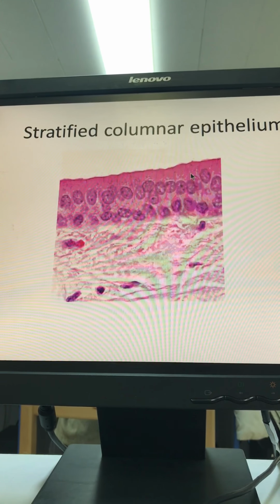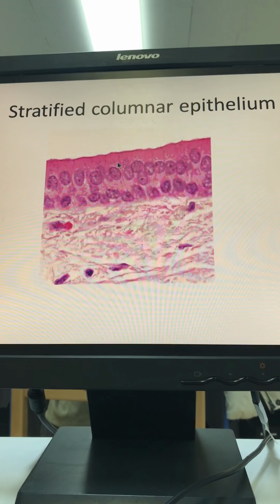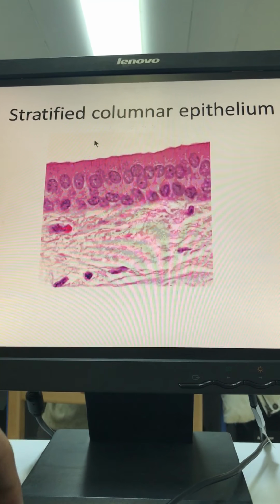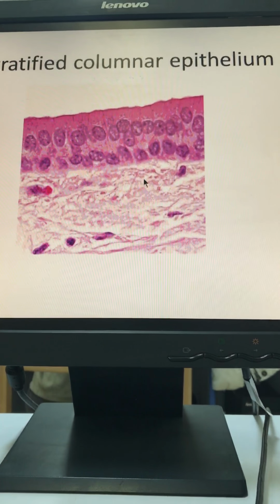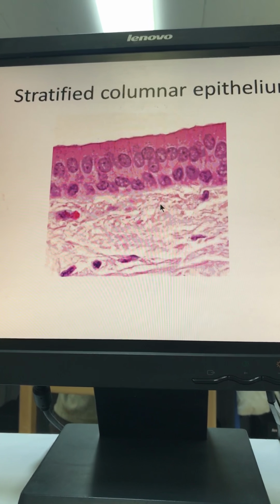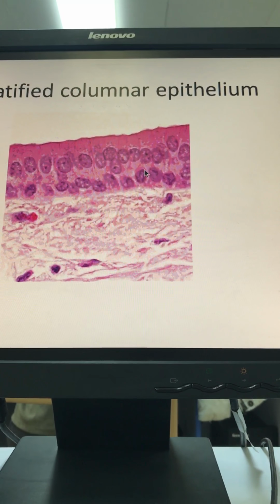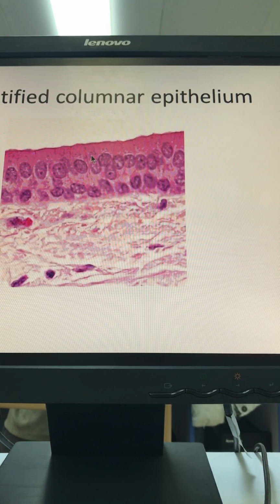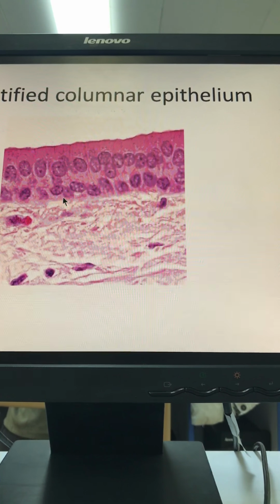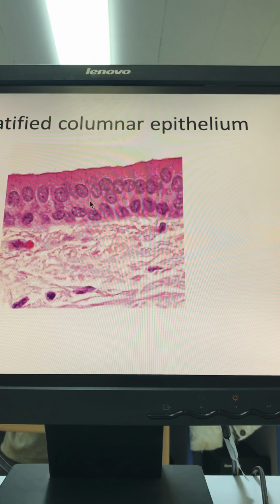Now, look here please. I can see two layers of epithelium. مش هيك? This is the surface. This is the free surface, apical surface of my tissue. Here the basal surface. Next to the epithelium شو التيشو هذا بيكون؟ Connective tissue. We have two layers here, okay? Two layers. Now I can notice that the top surface layer حكينا احنا طيب two layers فبنحكي stratified. Two layers means stratified. Now look at the top surface layer. This is now one layer and here we have the other layer.